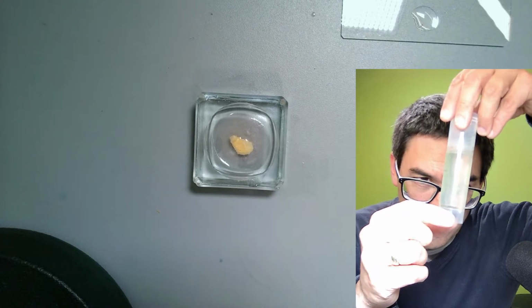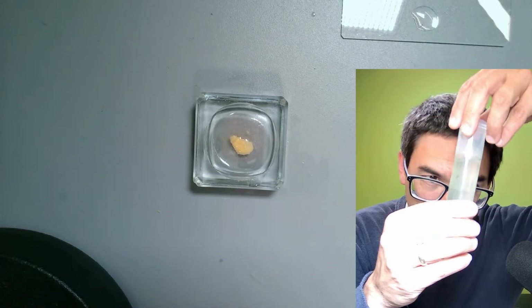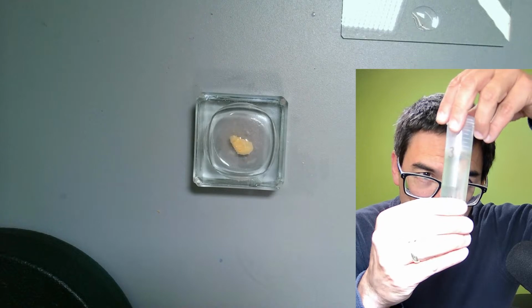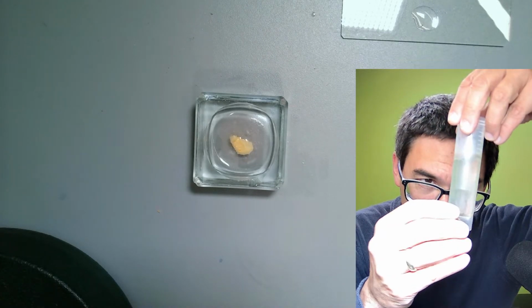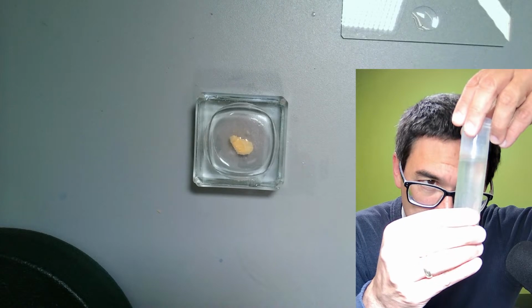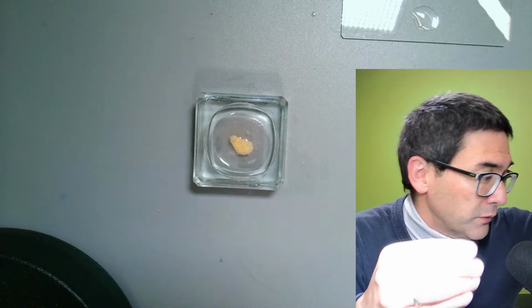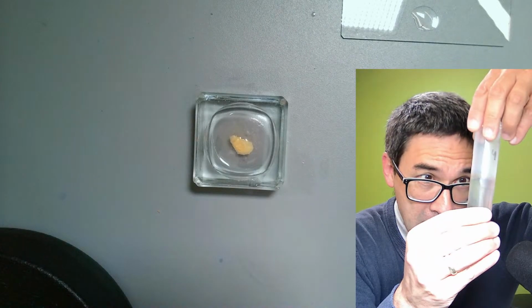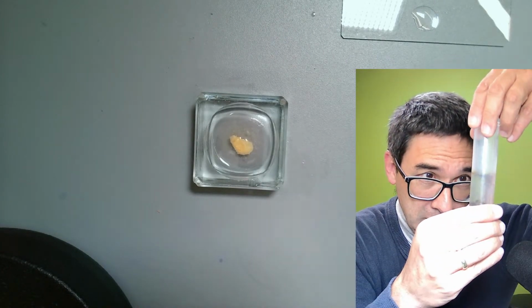Now, what you could do is add a little bit of alcohol to dissolve it better. But then you've got the problem that the alcohol might damage the organisms. Yeah? So that's also something you don't want to do. There's a whole bunch of water fleas in here. Just a second, I'm checking where my little... that's the one.